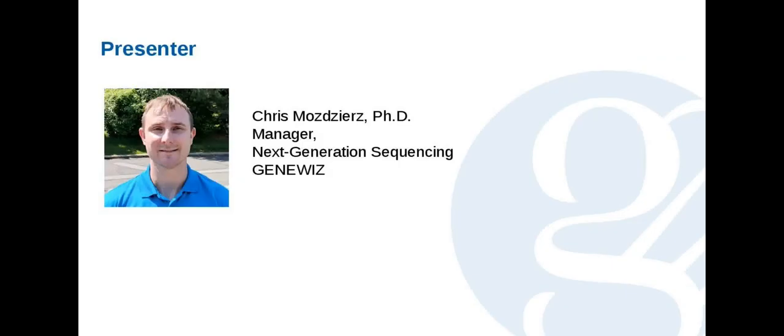Today I'll be discussing what's seemingly a very popular solution amongst researchers, amplicon sequencing. As you'll see throughout the talk, there are many different applications of amplicon sequencing, and within each application, there are many different considerations that you need to take care of when you're planning your experiments. Lastly, there are quite a few advancements in amplicon sequencing that many researchers are taking advantage of.